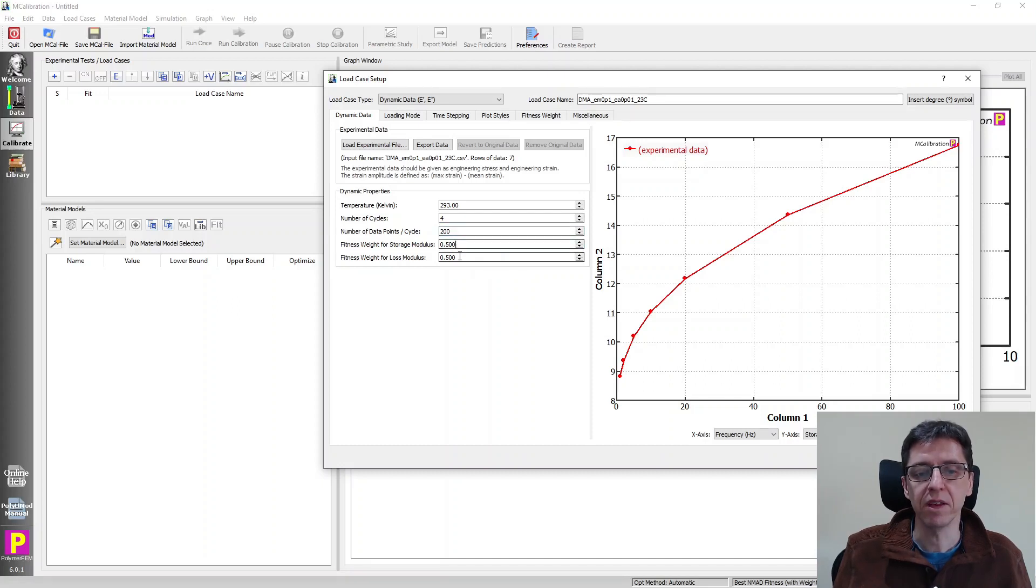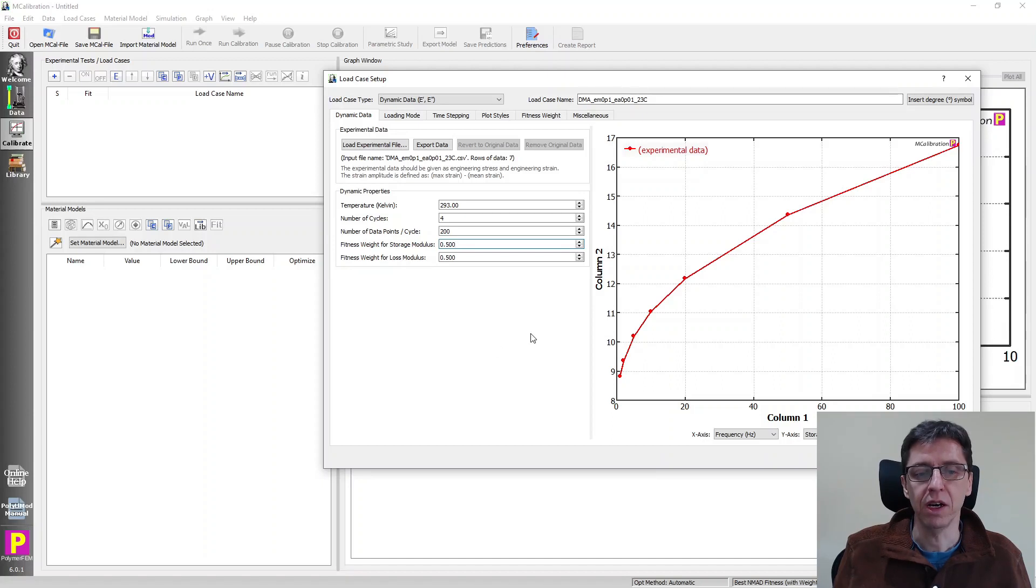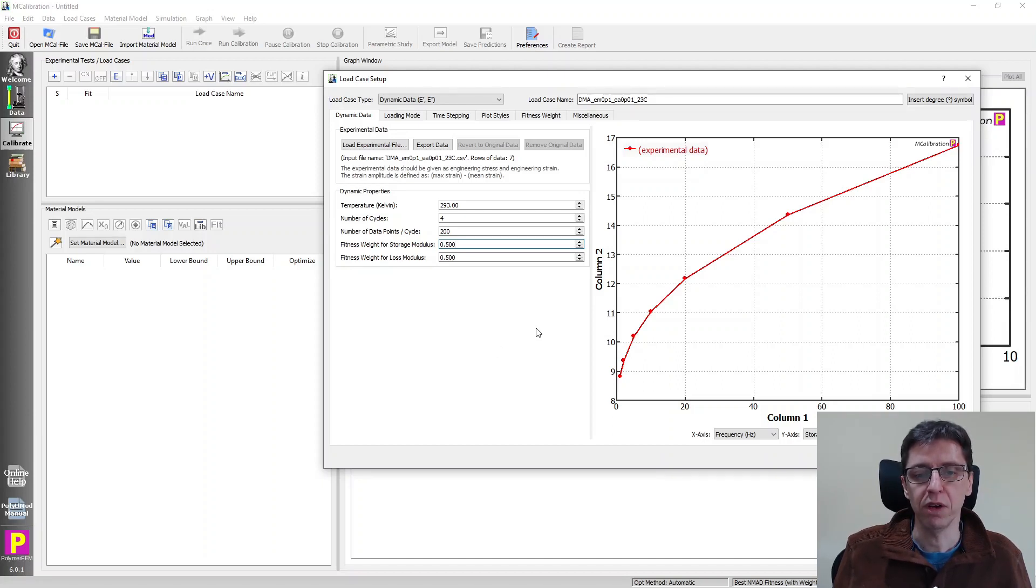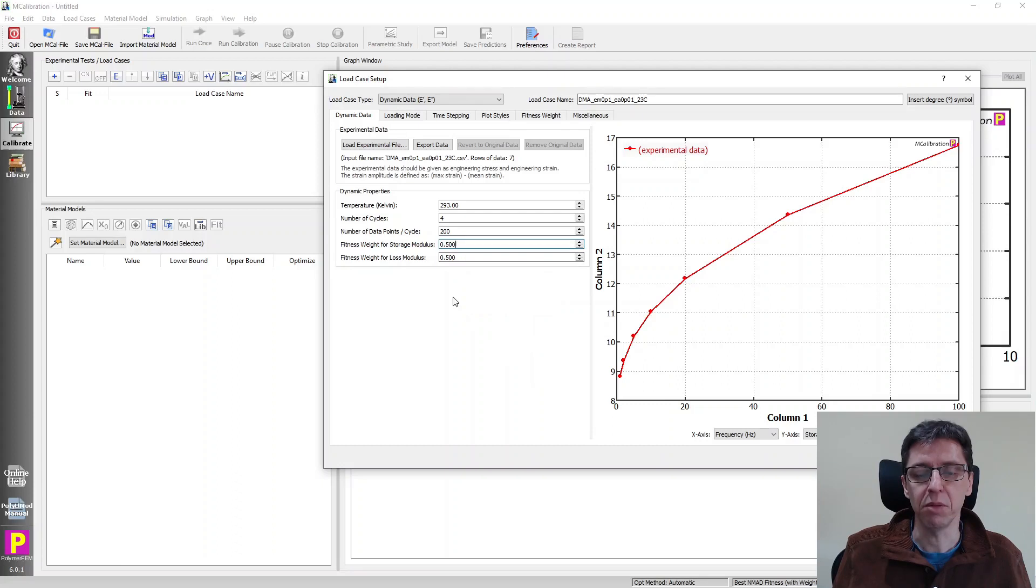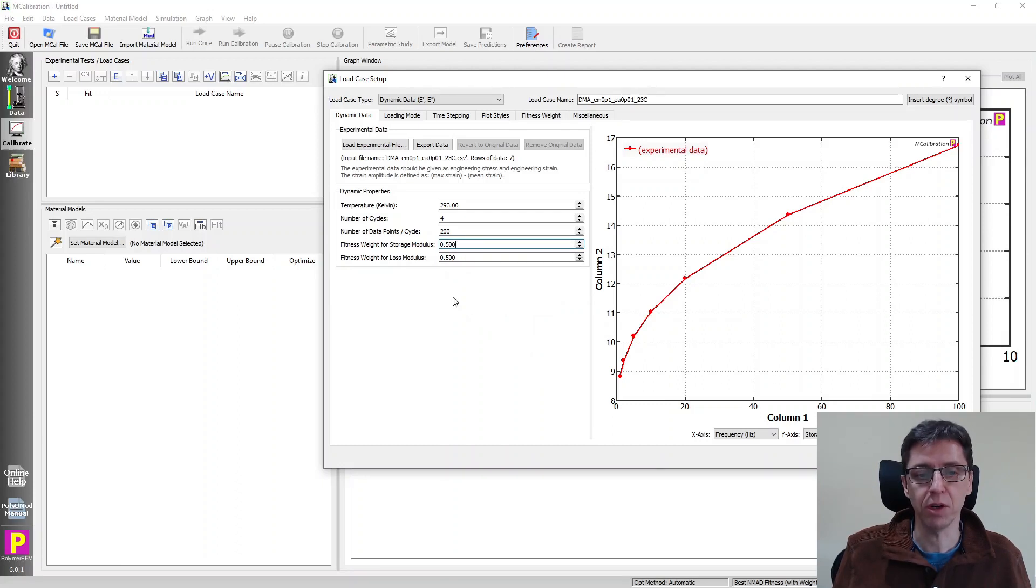This box here is how many data points should it take per cycle. And then these two boxes specify how important the storage and the loss modulus values are. If you want to calibrate a material model to the data by setting them to both be 0.5, that means that they're both equally important for the calibration. So again, we can keep the default here for now.